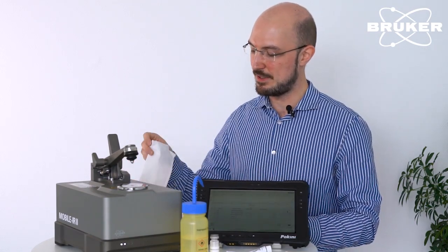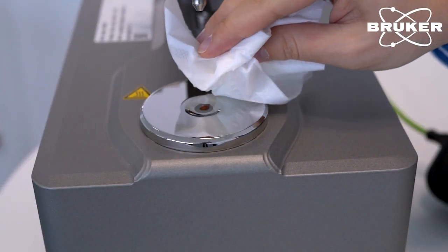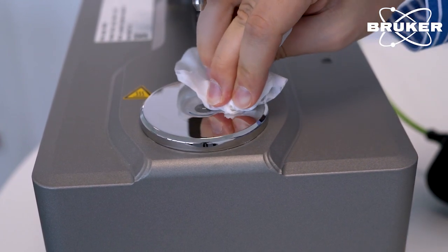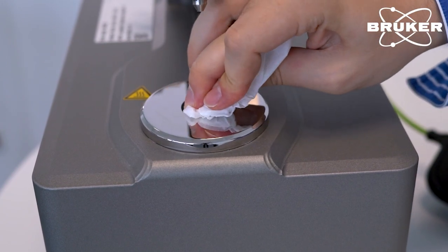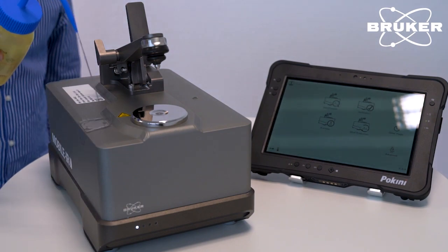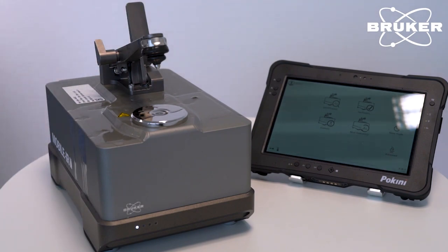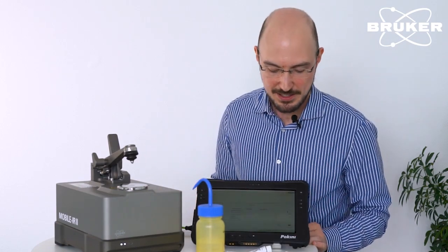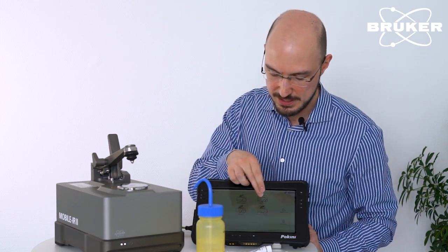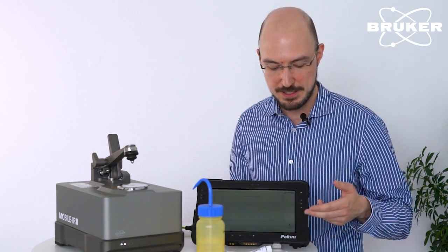Now, to measure the next sample, we need to clean the crystal. For this, we use some isopropanol and a tissue, and carefully wipe off the measured sample, in this case the paste, from the diamond plate. The mobile IR2 is IP65 certified, meaning that spray cleaning, which is an option in some laboratories, is possible, as shown here. After we cleaned the crystal, we now switch to the verification workflow. For this, we close the identification and switch to our verification. Again, we need to measure a background. Simply press Measure Background.